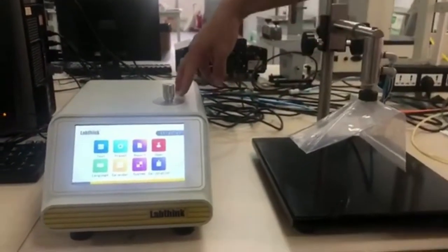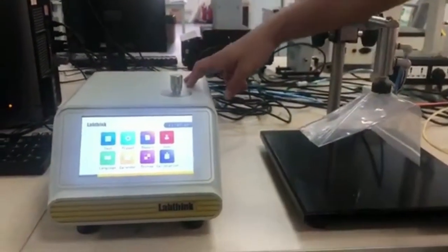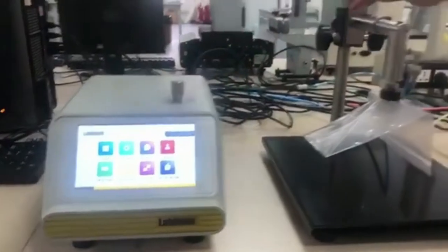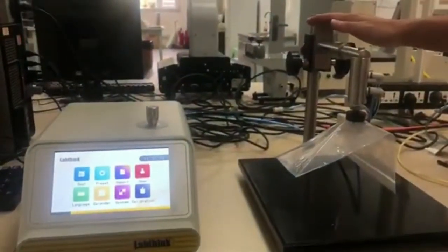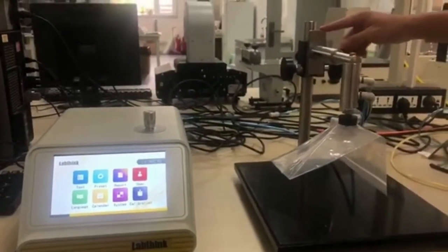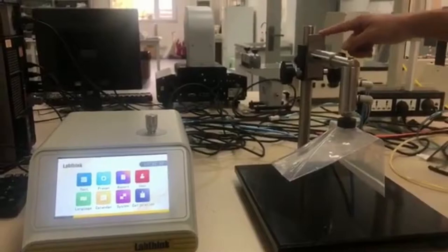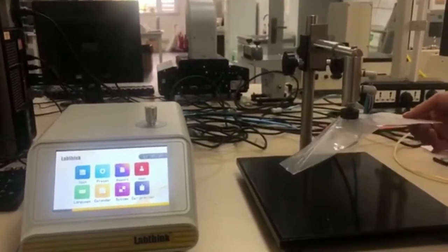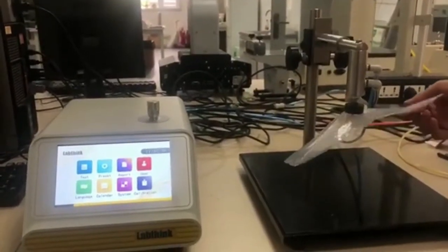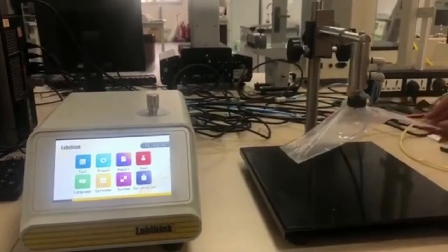This is the tester itself and this is the test station where we can load the test samples. Here I have loaded a pouch, you can see it here.